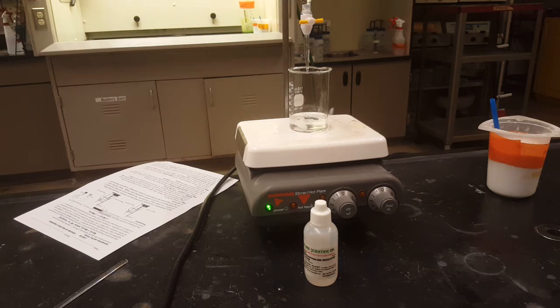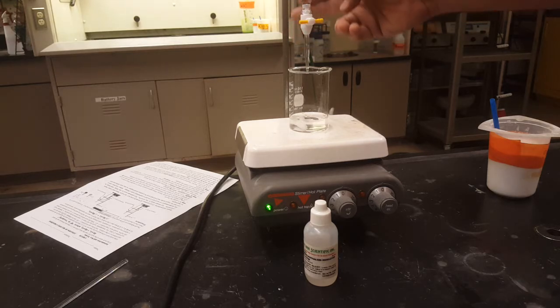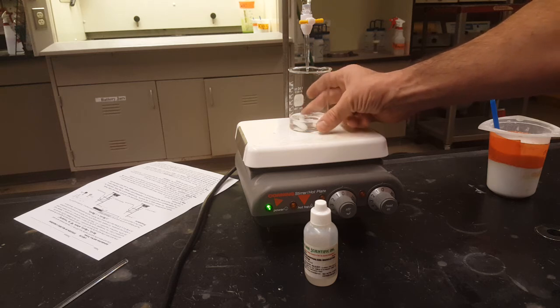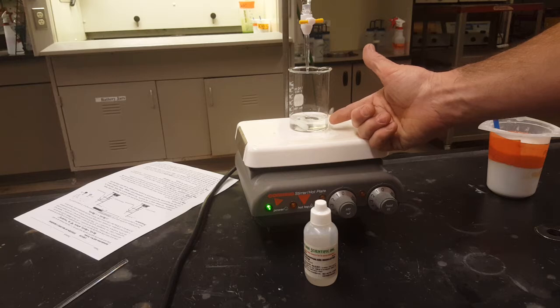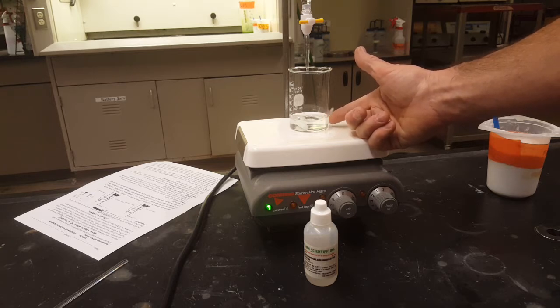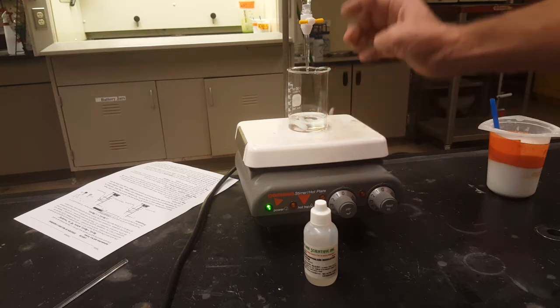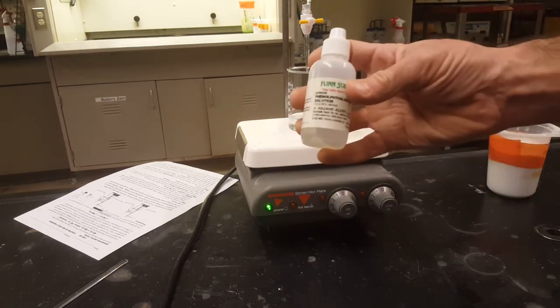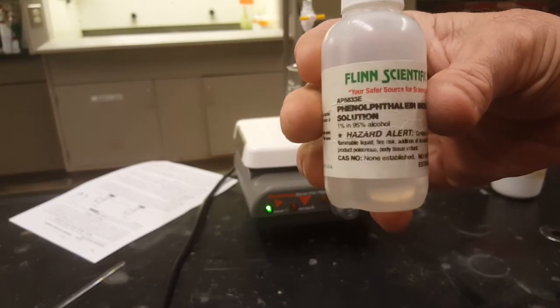Now the fun part, we actually get to do some titration. I've got my 0.3 molar sodium hydroxide, which is monobasic, here in the burette. I have an unknown molarity, 25.0 milliliters of diprotic sulfuric acid here in my beaker. And the only way that we're going to know today that we have passed through equivalency, which means that we have neutralized this acid with this base, is with a pH indicator. And the pH indicator that we're using today is phenolphthalein.